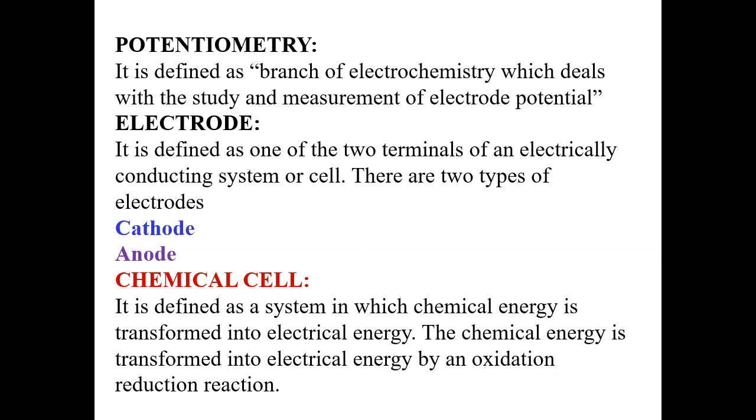Electrochemistry: the chemical activity of an analyte, measured on the basis of electricity, is called electrochemistry. When the activity is in the form of voltage, then it is called potentiometry. When the activity is in the form of current, then it is called polarography.